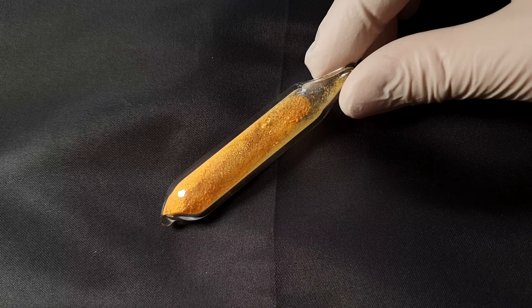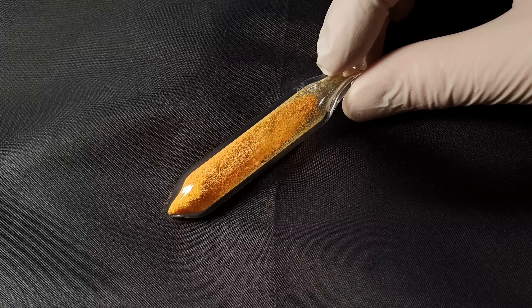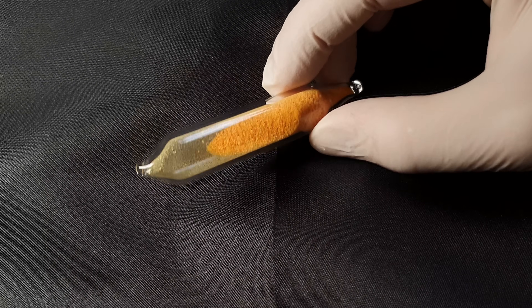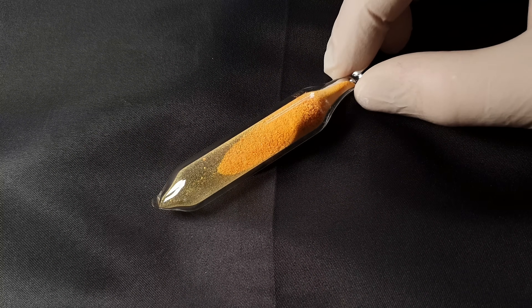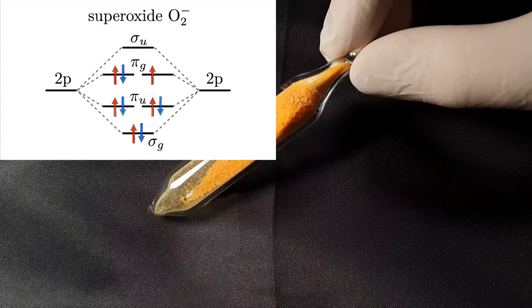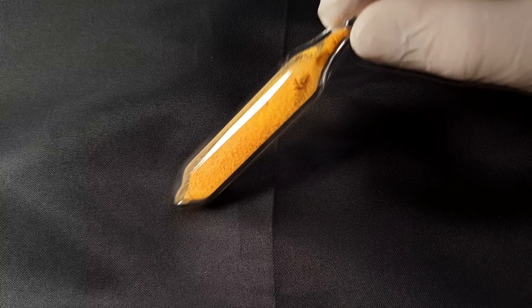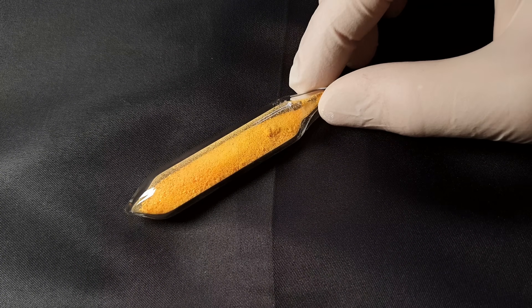Here you can see the product. It is a pretty yellow-orange substance. Because of the superoxide anion, the cesium superoxide should be paramagnetic. The paramagnetism is a result of the oxygen's unpaired electron. And I think it would be neat to show this paramagnetic property with an experiment.